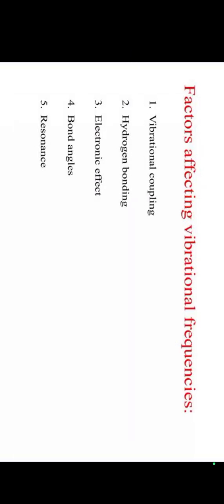Next we see the factors affecting vibrational frequencies. The first one, vibrational coupling, also affects the vibrational frequencies. Second one, hydrogen bonding: the bonding involving hydrogen also affects the vibrational frequencies. Third one, electronic effect, also affects the vibrational frequencies. Bond angle and resonance also affect vibrational frequencies. These are the factors affecting vibrational frequencies.